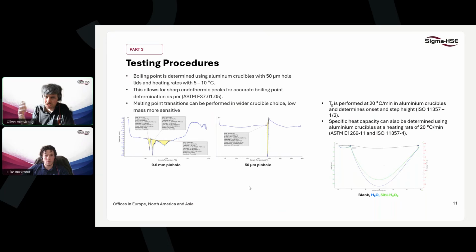There is residual vapor in the headspace, which has further been heated and then transitioned into an exothermic decomposition very quickly. So we tend to integrate the heat of vaporization up to the top of this exothermic peak to account for that potential loss in the vaporization energy that we've seen, because the two peaks are overlapping.